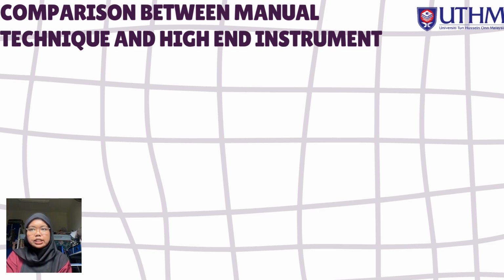Also, for the differential scanning calorimetry, the advantage is that it accurately detects thermal denaturation temperature, like ovotransferrin at 63 degrees Celsius, ovalbumin at 76 degrees Celsius, and enthalpy, allowing precise protein characterization. Also, it can reveal interaction in protein mixture and effect of pH on thermal behavior, aiding formulation design. It is applicable in quality control and optimization of industrial heat treatment.